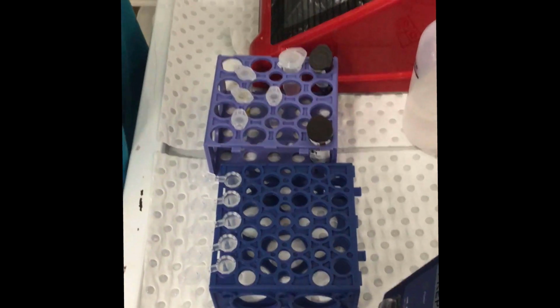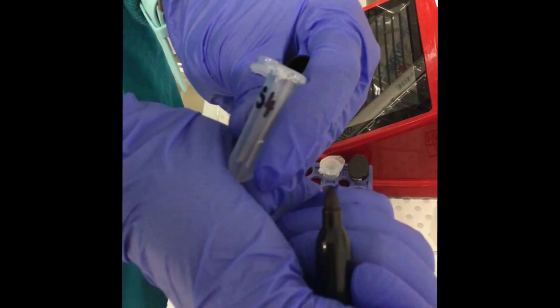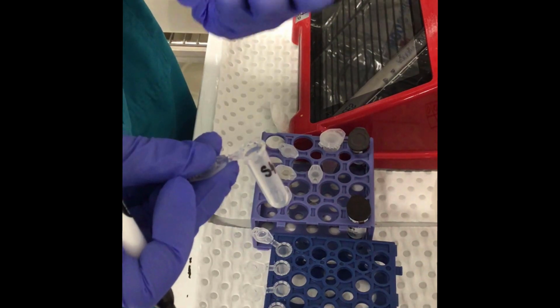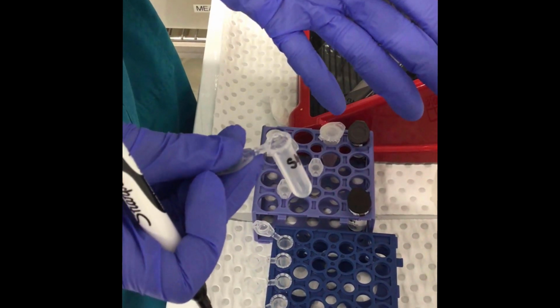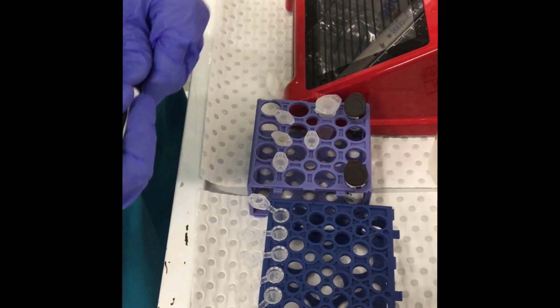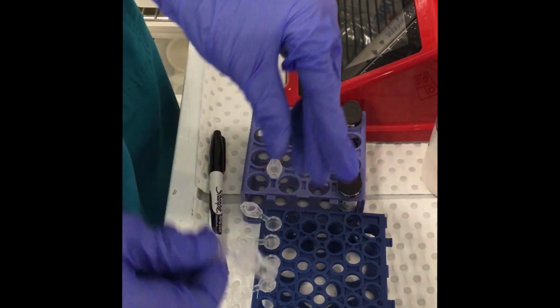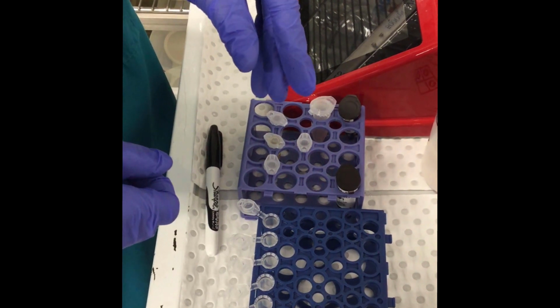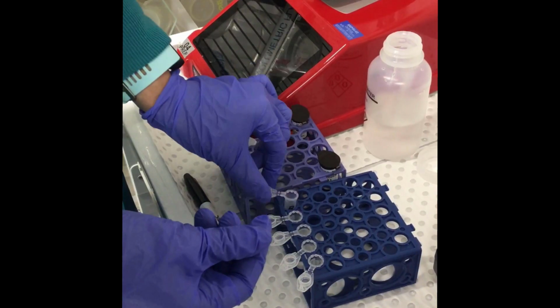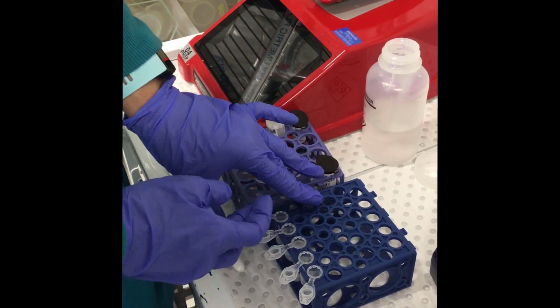We're now going to prepare a set of glucose standards. You'll notice in your lab manuals that you have 5 glucose standards. You have a blank and 4 standards with concentrations of glucose in them. I'm going to start by preparing my S4. S4 requires 200 microliters of our glucose stock standard. So you can see that our S4 is our most concentrated standard, all the way down to our blank, which is 0.